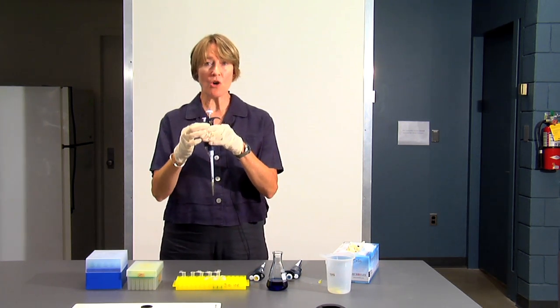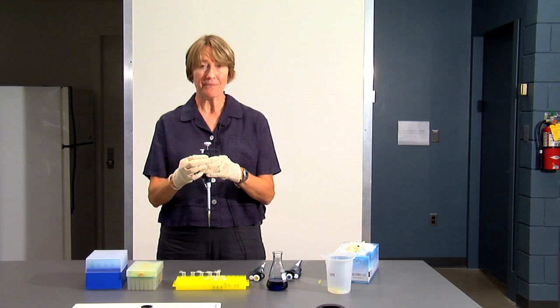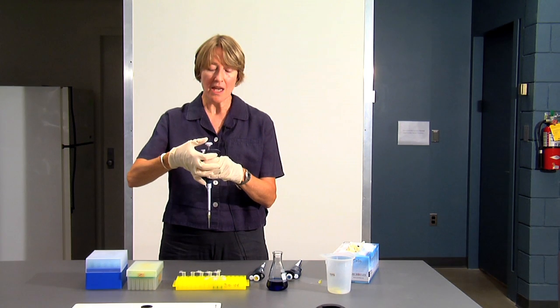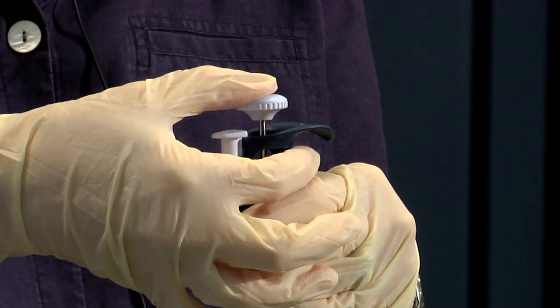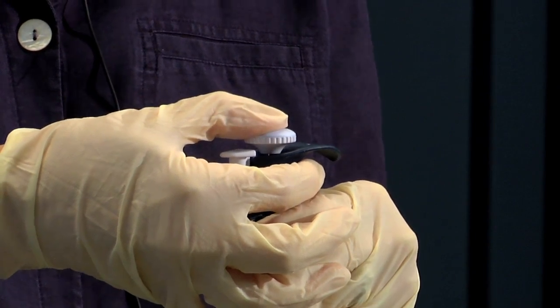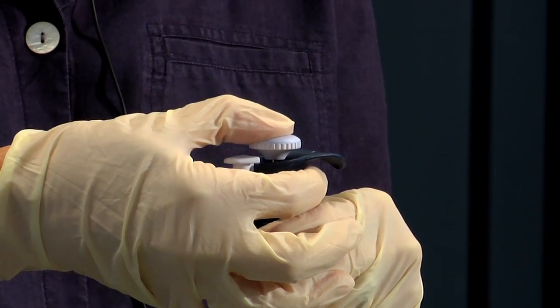The other thing to notice about the pipettes is that there are two stops on the plunger. This is the plunger. If you press the plunger to the first stop, it goes down pretty easily. If you press the plunger to the second stop, it's a little bit harder. And I'll tell you what that's for as we go through the demonstration for how to use it.